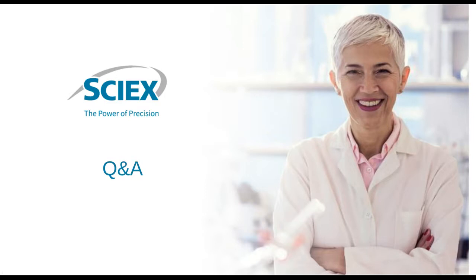Thank you, Whitney. The next question: in CZE, you can normally not speak about basic or acidic peaks. Why is this mentioned in the kit? Because all peaks will have a positive charge. It's because the variants are in relation to the PI of the main peak, and are either a shift in the basic region towards the basic pH or towards a more acidic pH relative to the PI of the main peak.